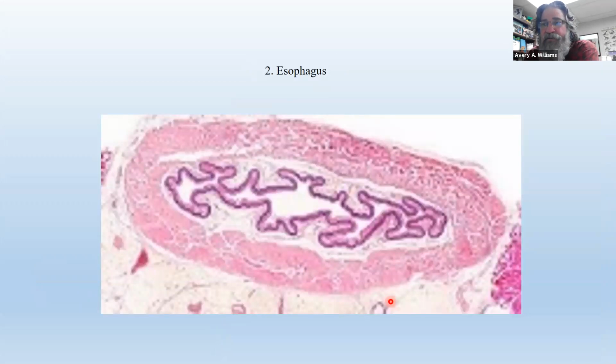Now we're moving on. I think we're looking at like 4 slides today. This is our second of 4, I think. Something like that. This is our esophagus. I do about an hour's worth, I think. I think it's about 4 slides.